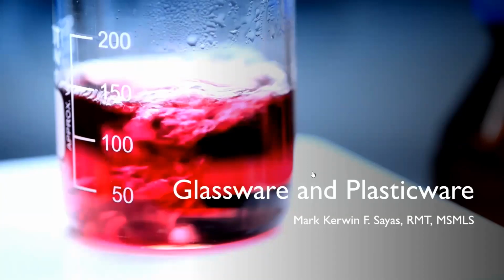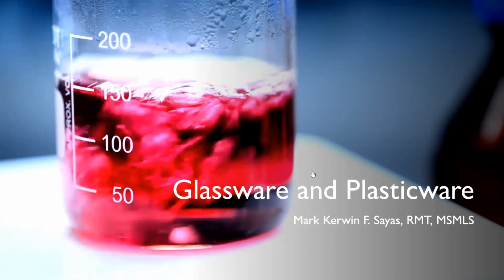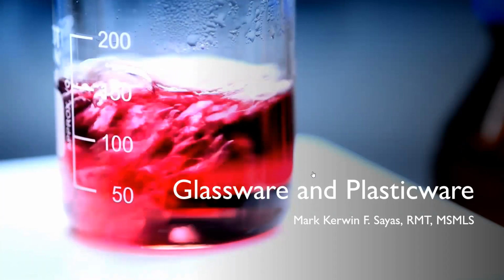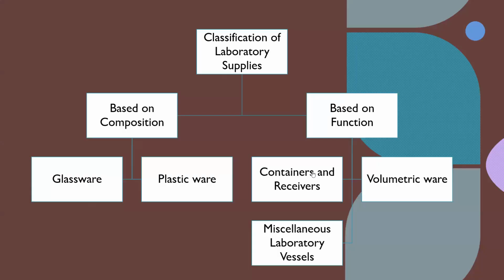Good day, everyone. In this lecture, we are going to discuss glassware and plasticware that we are using in the clinical laboratory setting and in the clinical chemistry section. We can classify our laboratory supplies based on their composition and based on their function.